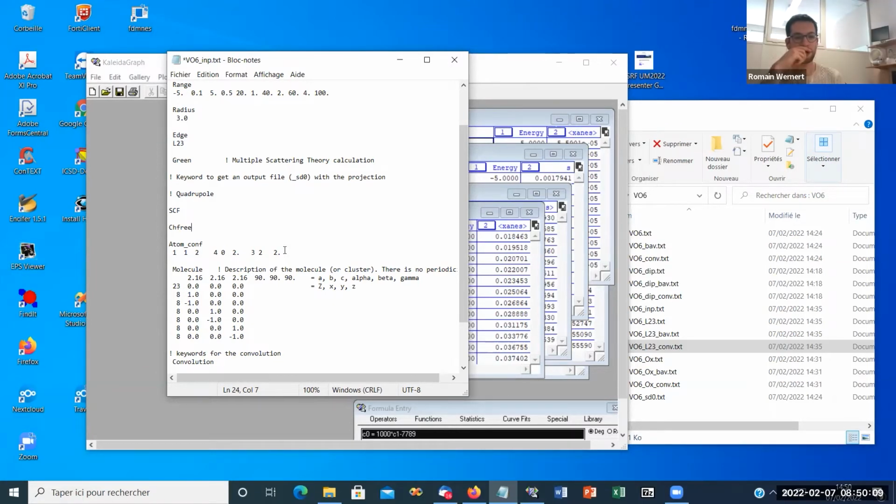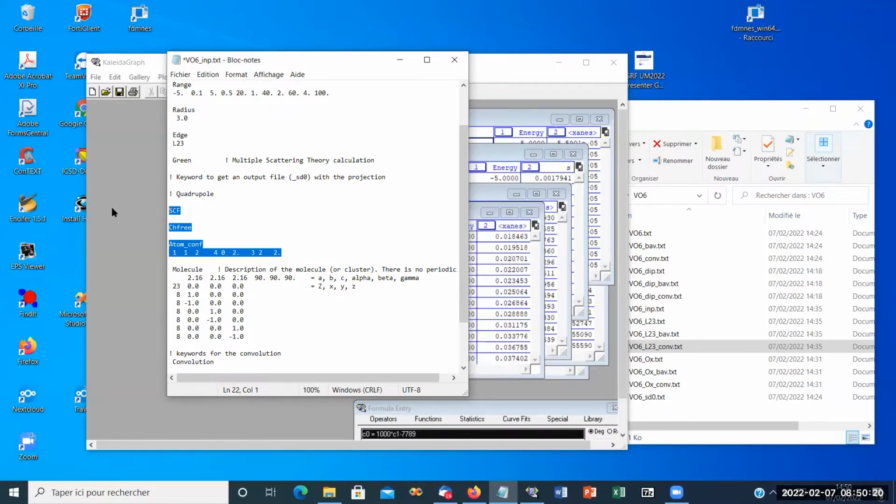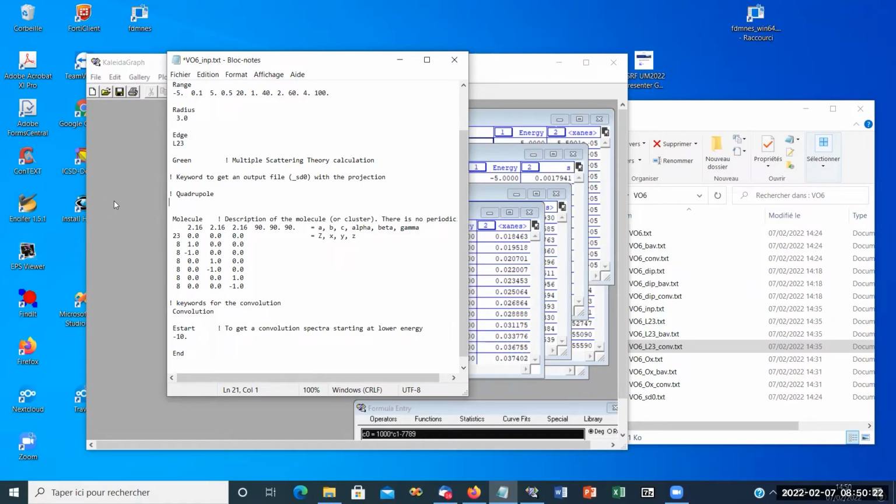Okay, thank you very much. Okay, bon. I suppress that, SCF. Okay, now we could change, so I suppress that, edge.